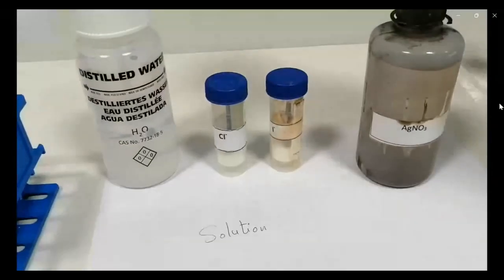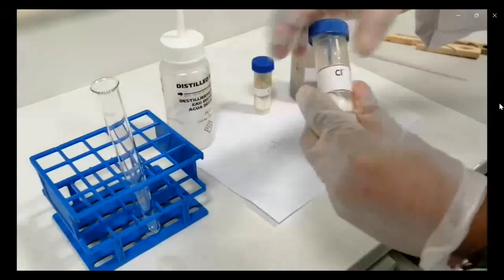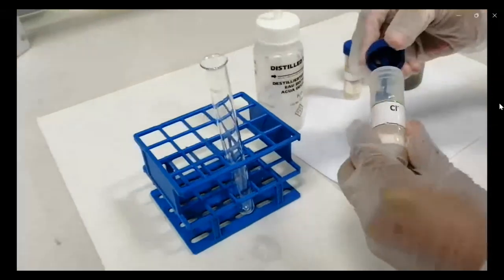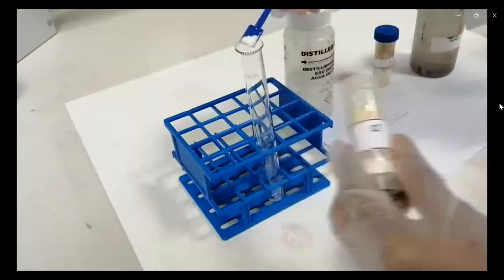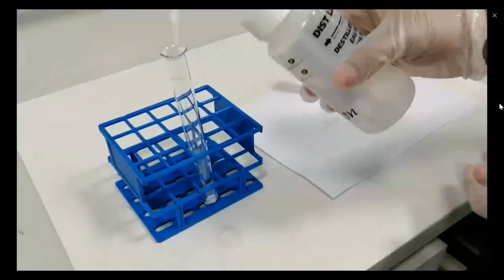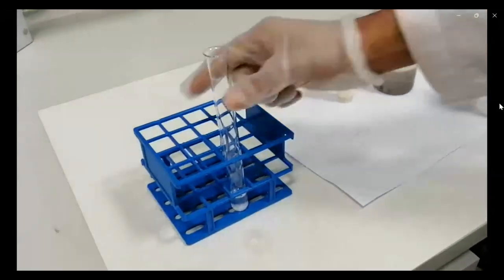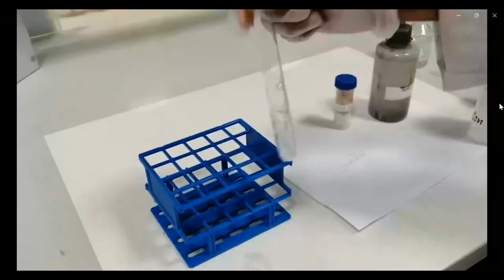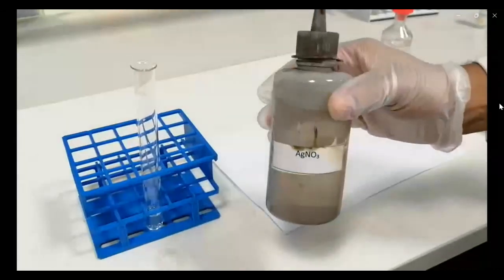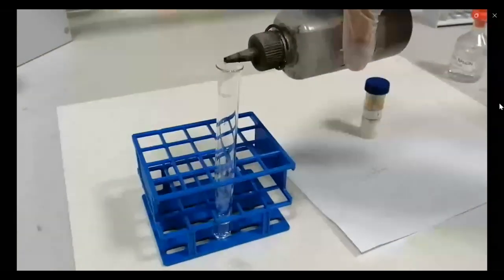Now we will go to the confirmation tests. The first confirmatory test: solution plus silver nitrate. You have to prepare a solution first, a few crystals plus a few milliliters of water. Then mix them very well. Then add the chemical reagent, which is silver nitrate.